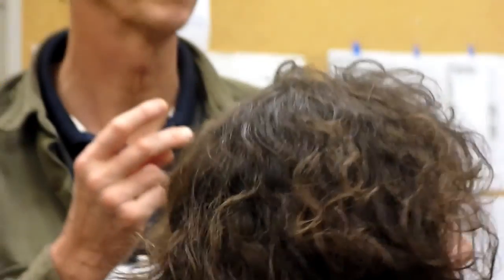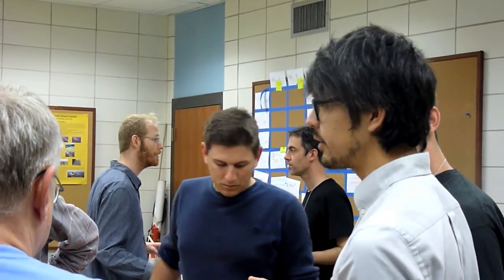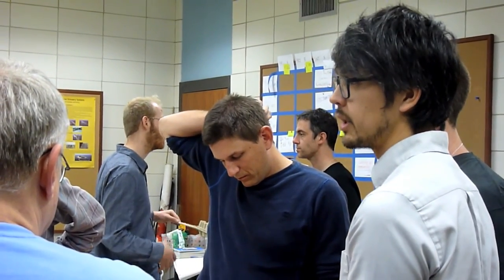So there's some discussion on the forum. Some people were concerned that the two lines you're using to calibrate are in the middle, close together, instead of out on the edges. I can't remember what people thought you should do about that. There's a feature in the API now, which is totally new, but kind of works. You can use any two known lines. Some people wanted to use a green laser and a blue laser, or a red laser and a blue laser, two other lines besides the ones we chose, because anyone has a fluorescent light, so you don't have to buy a special laser.